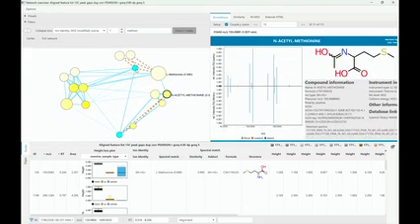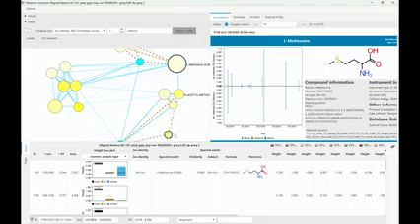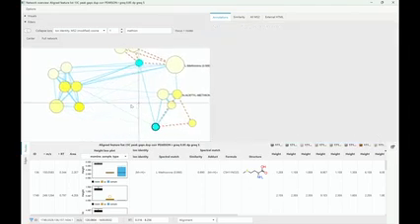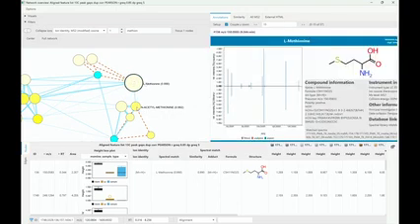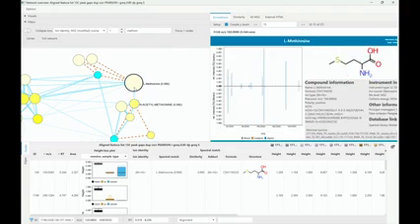And the next neighbors are here defined by spectral similarity, but then also by the ion identity network. So if you see those orange edges, they're actually different adducts. For now, the annotation tells us it's methionine and N-acetylmethionine. And of course, we can say these are structurally related compounds, and we expect them to fragment similarly.